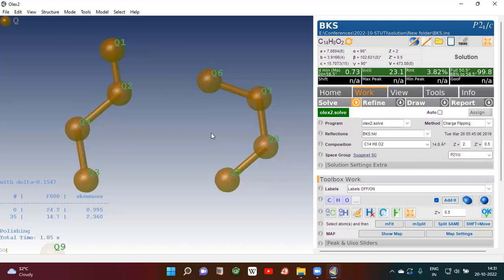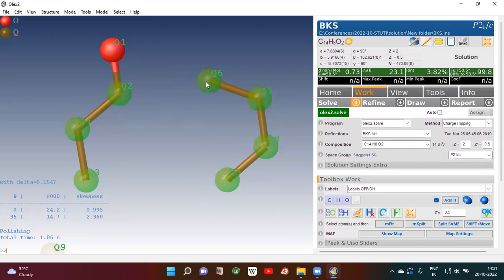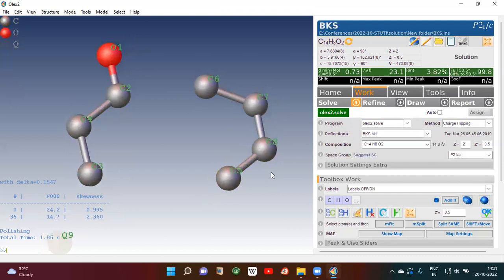So if we have a heavier atom, then probably that is Q1. I know I have only carbon and oxygen, so the strong possibility is that Q1 is oxygen. I will click here and then go to oxygen. I know all the others are carbon atoms because I know my molecule. I have clicked them and then clicked here, so I have assigned carbon atoms.